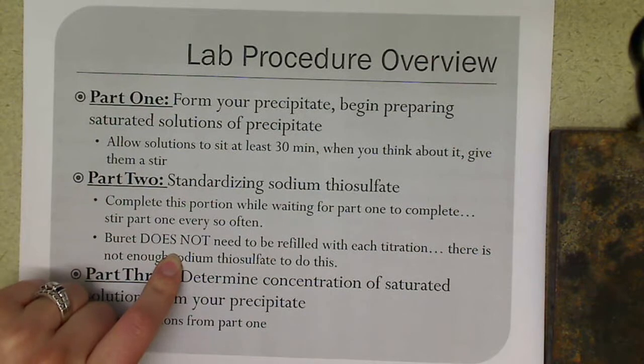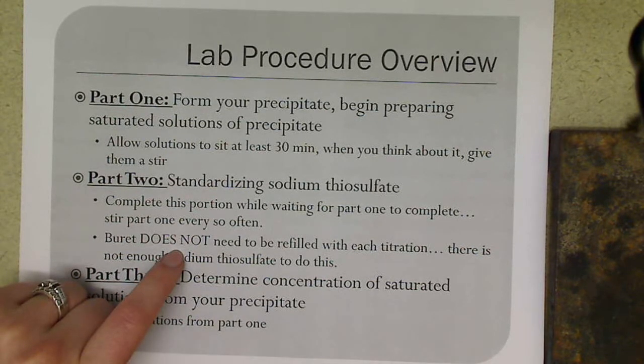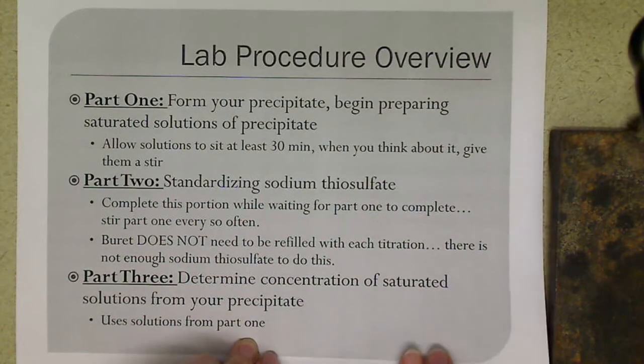One thing that's different than the titration lab is you do not need to refill your burette with each titration. Okay? If you do refill your burette after each titration, you are going to run out of sodium thiosulfate. Okay, there will not be enough for everyone to complete the lab. Once this solution is gone, it is gone. Okay, we cannot prep it again because the concentration will be different. So just be very aware of how much solution you're using.